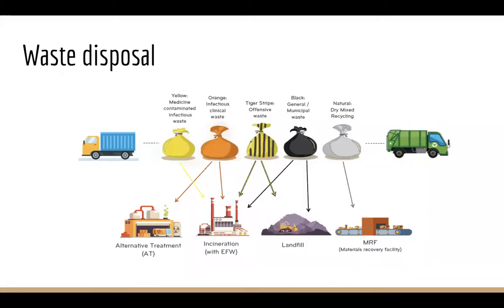A lot of the time there'll be a sort of panel which can say whether you're allowed to do something or not. And so for instance, if you're working with a class 2 organism, a lot of the time you'll be using something such as ChemGene, and ChemGene you can order online through an order system to wipe down any surfaces or areas, or even tubes where your organism's been, and also ethanol, so 70% ethanol as well.